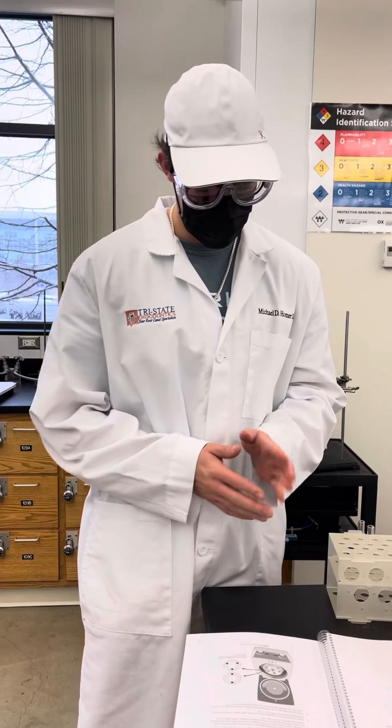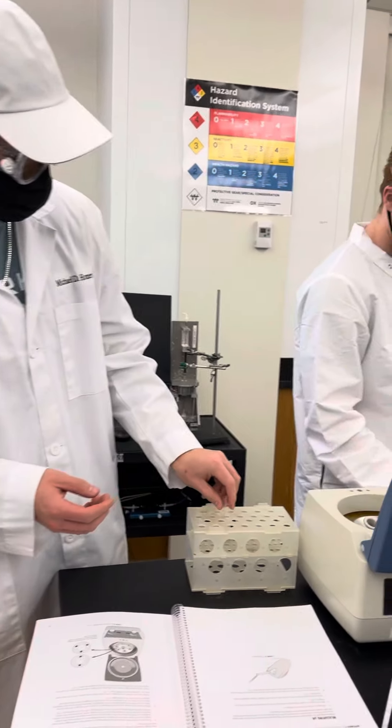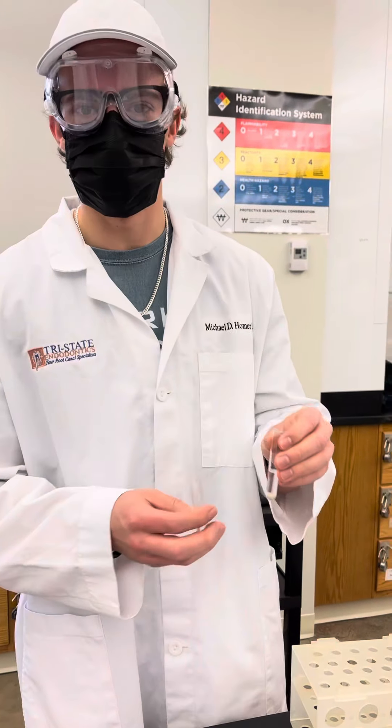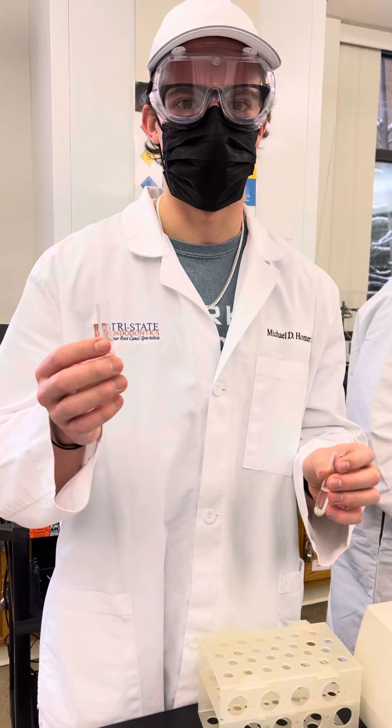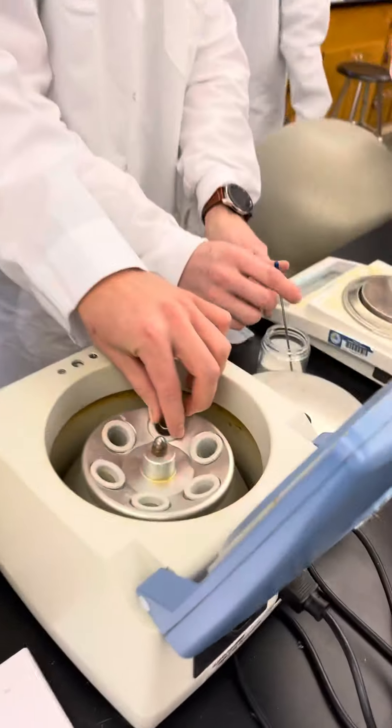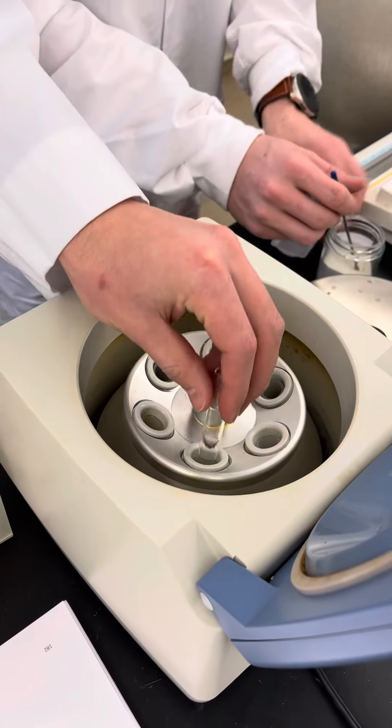So first step, we are going to put our test tubes, put the solutions and create the desired precipitate, and then we're going to take a counterbalance test tube and put it opposite of the other test tube and counterbalance it.